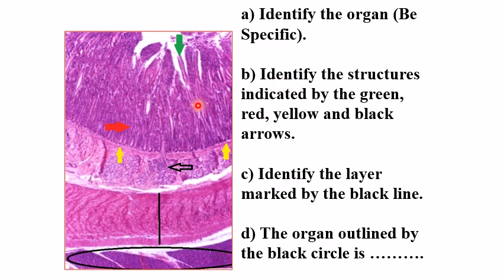Identify the organ and be specific. Here I'm having villi and crypts, so I am in small intestine. What part? I'm having two options, duodenum and ileum. Look between the mucosa and the musculosa. I can see here what, dear students? Glands, which are known as Brunner's glands, mucus secreting glands. So it is the duodenum of the small intestine.